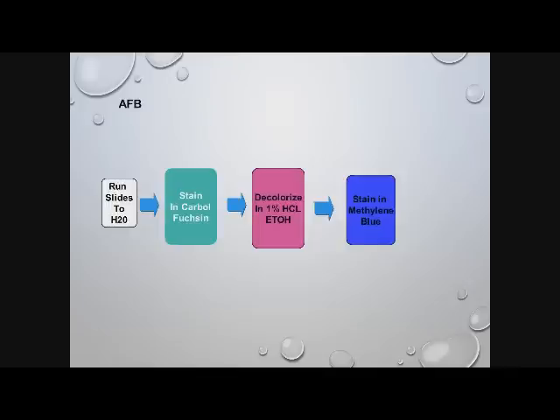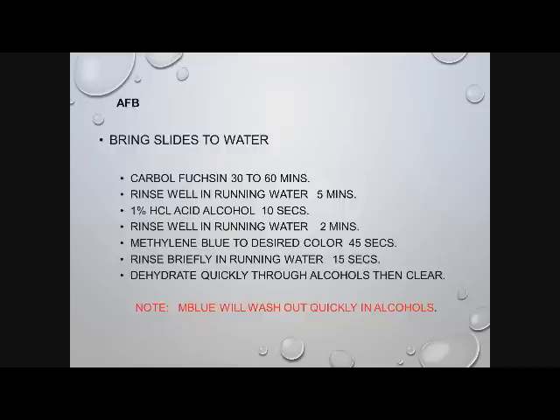So don't be afraid to leave it in your hydrochloric acid long enough to get rid of all the blotches. There's nothing worse than having little splotches of carbolfuchsin still on your slide to mess it up for you. So just get it clean. You've got time. It's not going anywhere. So here's a procedure, pretty simple. You have to be careful with the methylene blue because it'll wash out quickly in alcohol, so you may want to limit that time or limit the number of alcohols.